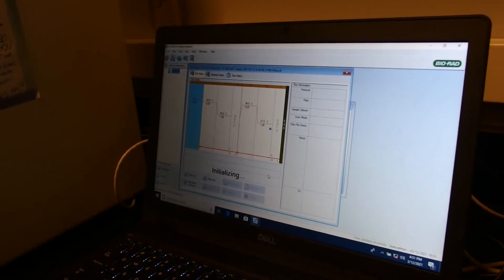Click save and it started. In about an hour and 45 minutes this will be done.